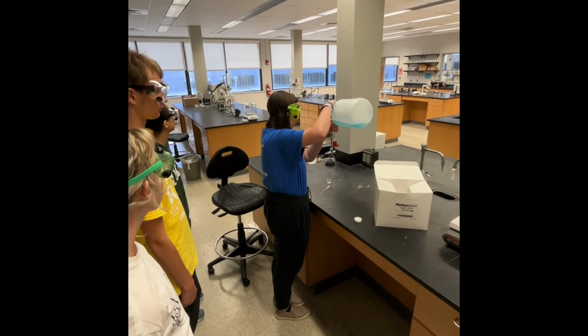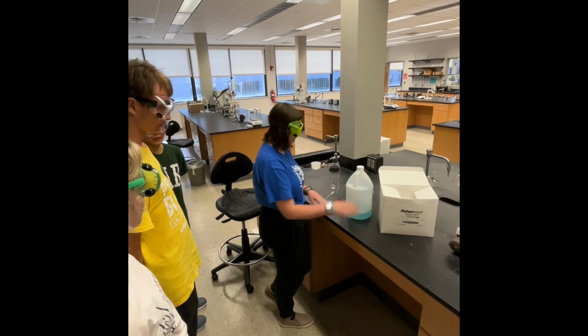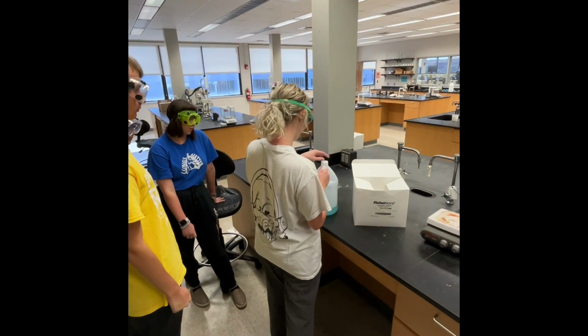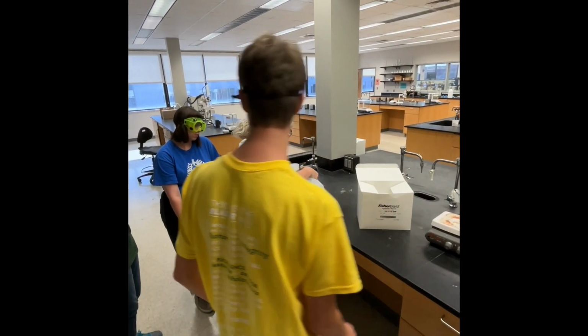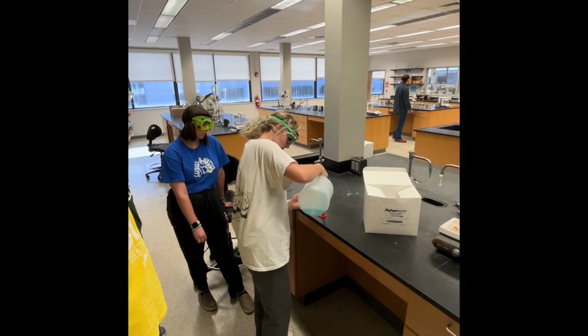We had to decide what volumes of each concentration we wanted to make. These should be reasonable based on the amount of stock solution we were starting with, which was 25 milliliters, so we may want to go down to 20 milliliters, then 15, etc. We'll show what we actually did later on in this video.